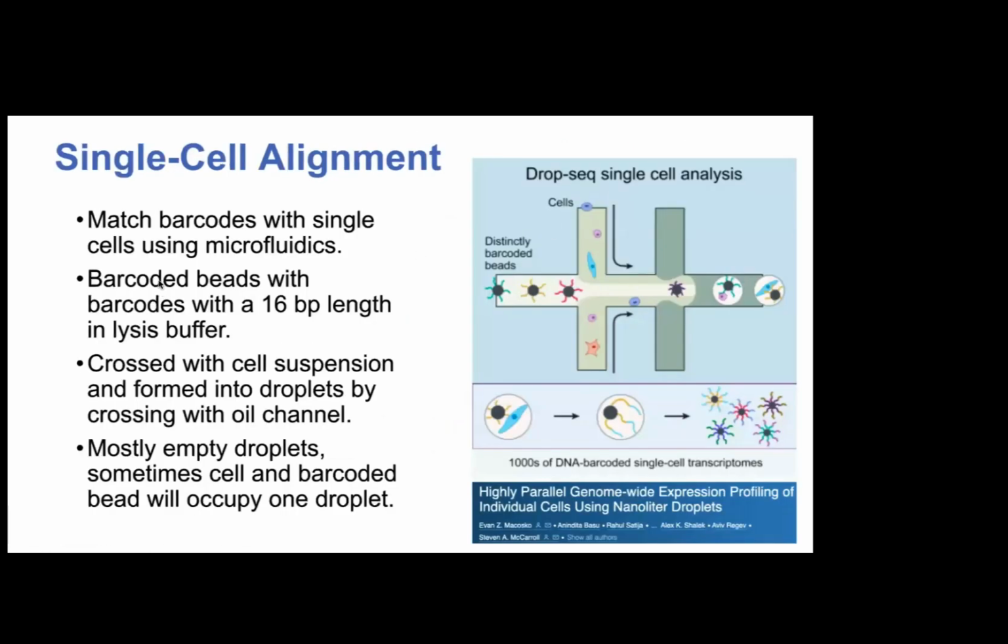Okay, so now, to some fun stuff. Single cell alignment works kind of the same way. In the end, we get a FASTQ file, and we just have to find where it came from on the reference, with slight modifications. The slight modifications are that every read has a barcode and something called the UMI, which is a unique identifier for that sequence.